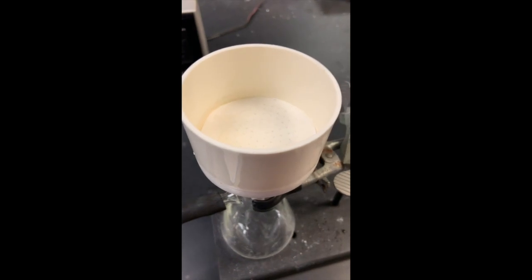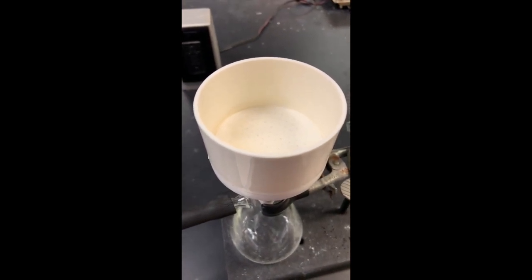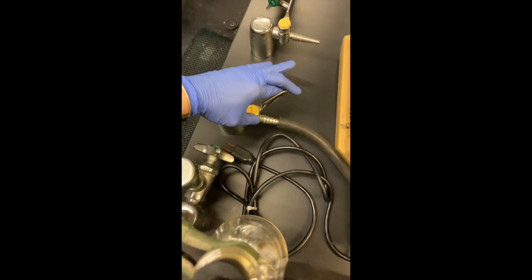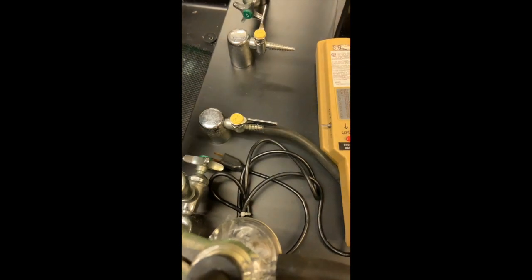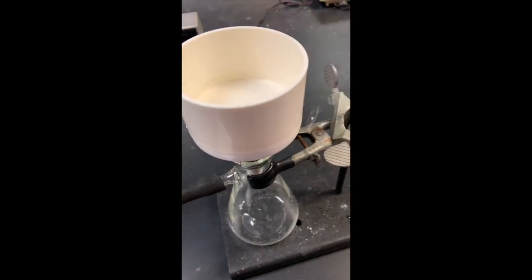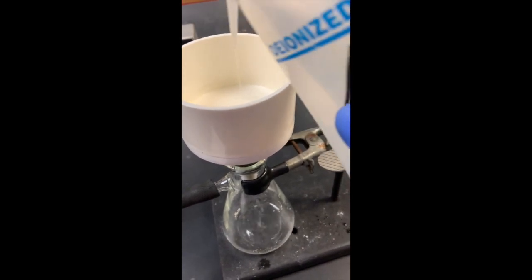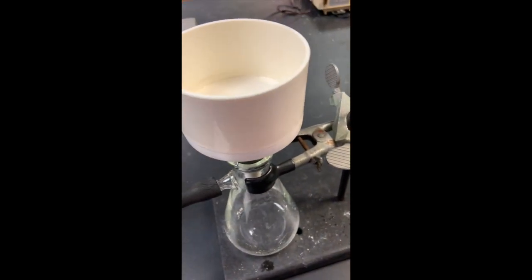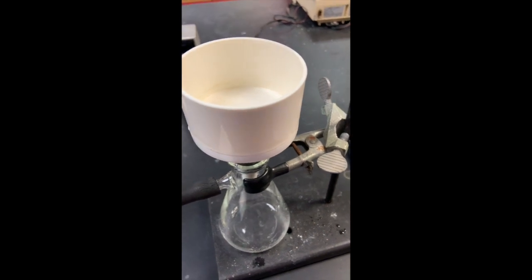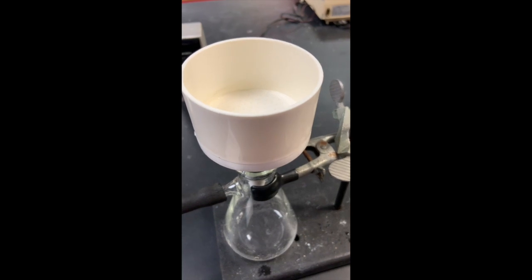And then I'm going to turn on the vacuum so you can see what it looks like when this is vacuuming. I turn on the vacuum here, and you can hear the airflow. And I'll spray with some water, and the water is vigorously coming out through the funnel there. So that is what I'm going to be adding my synthesized aspirin to.